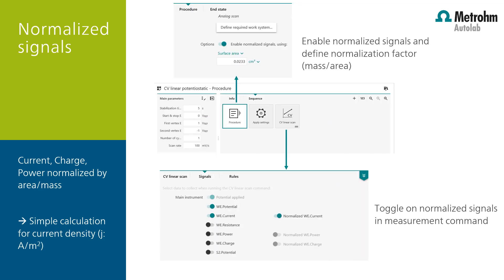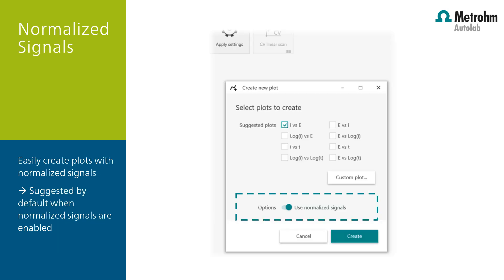The normalized signals are enabled in the procedure tile in the sequence. The signals which could be normalized are the current, the charge, and power. These signals are sampled in the measurement command. The normalized signal can be toggled off or on. When the normalized signals option is enabled in the procedure tile, by default the use of normalized signals is also enabled in the create new plot option, which means you will see the measured current density with respect to the applied potential when you create a new plot. The user can still plot the measured current versus the applied potential, and both plots will be visible in real time.